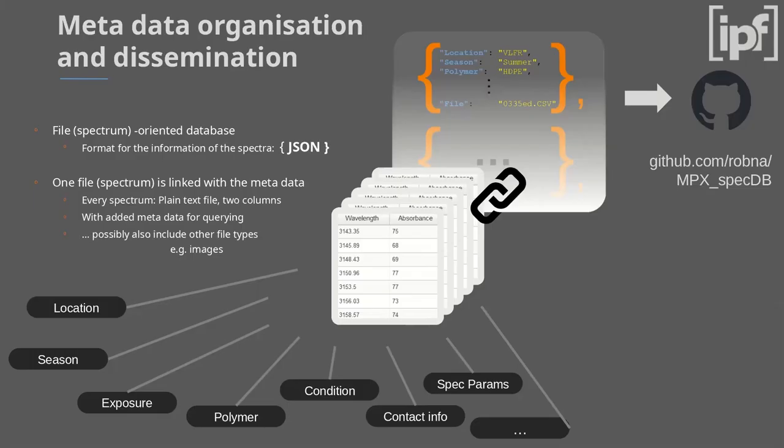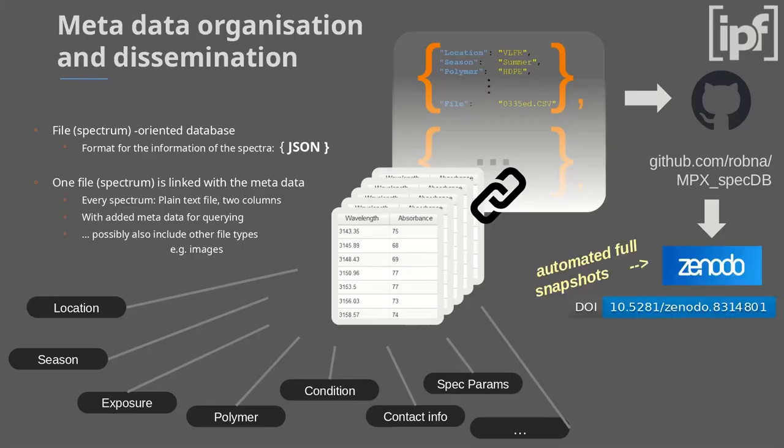So I put this all together in a repository and snapshotted it on Zenodo. But I also wanted to have the chemical data itself available on the Radar for Chem repository. And actually, maybe hopefully after the talk, we can talk a bit about this strategy because I'm not quite happy with this, because now I have kind of a double availability of the spectral data, at least.